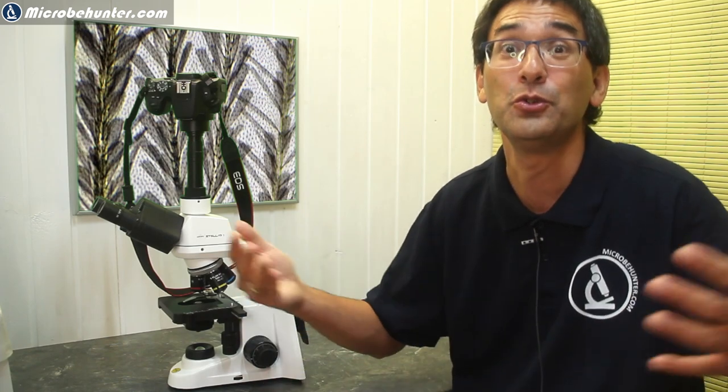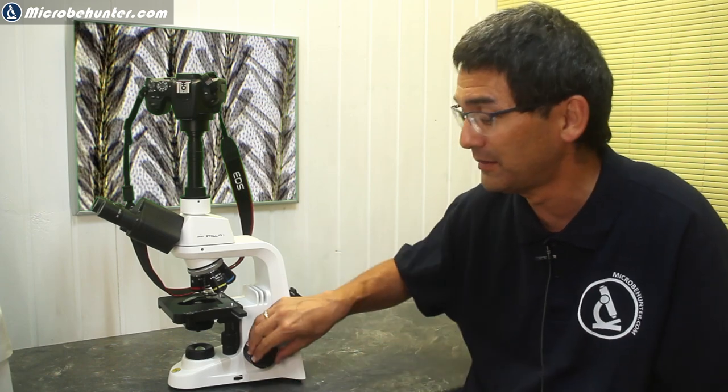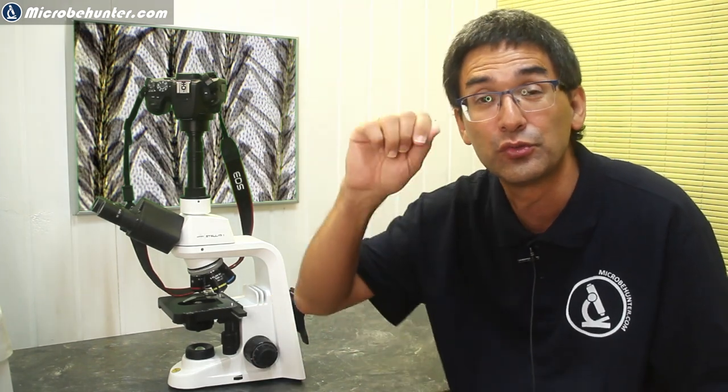And another thing that I like is that the coarse and fine focus knobs are relatively large, or at least larger than in other microscopes that I've seen. And while this is not a huge advantage, I like it a lot because it's simply easier to focus a little bit. And there's a pretty good grip here. And if the focus knobs have a larger diameter, this also allows you to control the focus a little bit more precisely. I know this is a little bit a question of taste, but it's still something that I would like to mention.